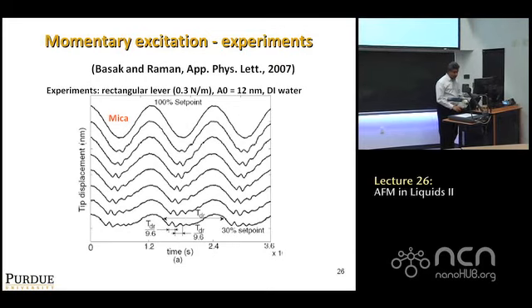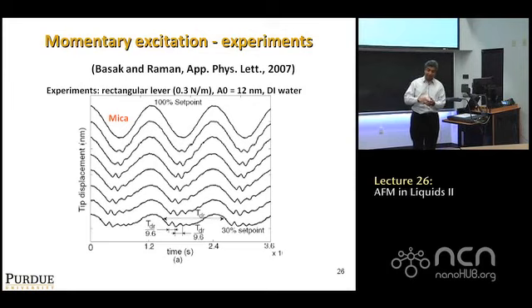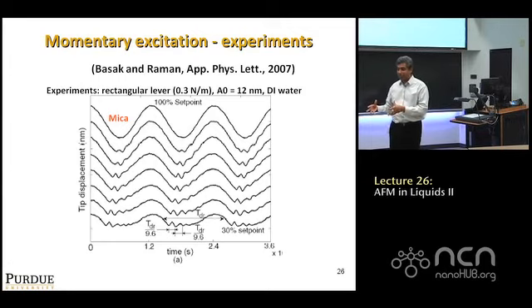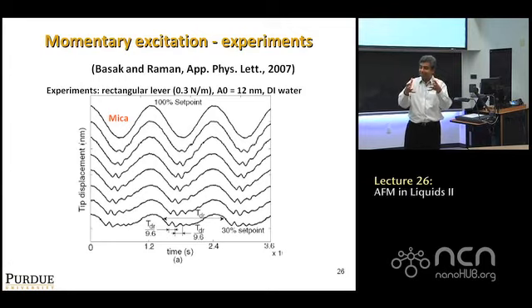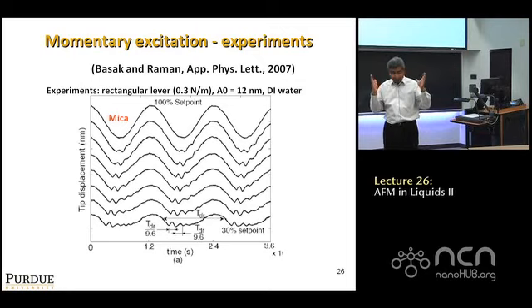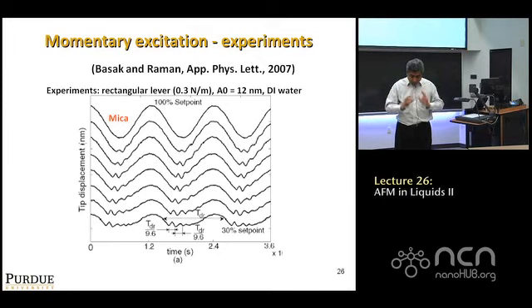You can do other tricks. Instead of looking at the second harmonic, remember this phenomenon I talked to you about, that when you tap, you're making the second harmonic ring. So if you want to map local properties of samples, you can imagine the following experiment. Let's say you've got a basketball in your hand, and you want to map the properties of the surface, you know, the table, the carpet, etc. And, being very simple, one way would be I'm going to leave the ball, let it hit, and see how high it bounces back up.